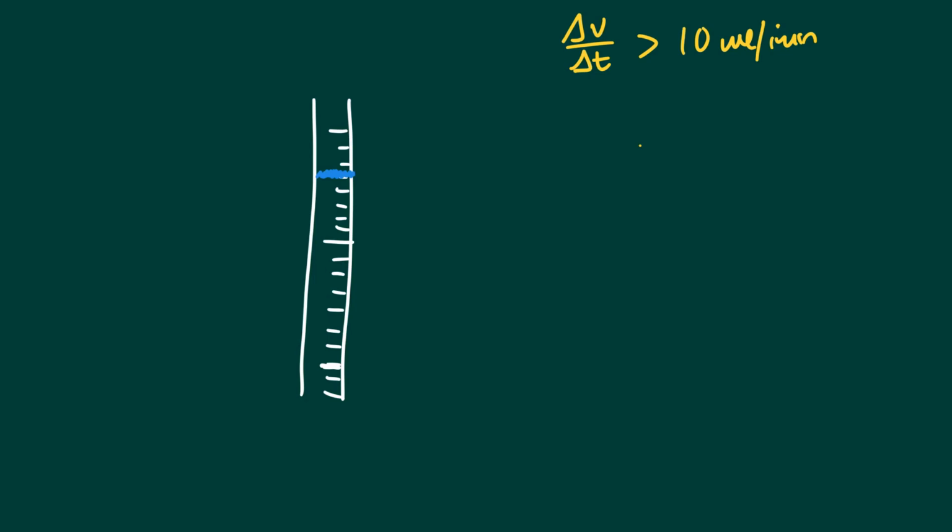So when you do this measurement, it's very important to take as big a volume as possible. So have some virtual marks on your pipette. You know, if you are running at as high as 10 milliliters per minute, try and make that volume as big as possible. Let's say we can make this volume to be a total of 40 milliliters.